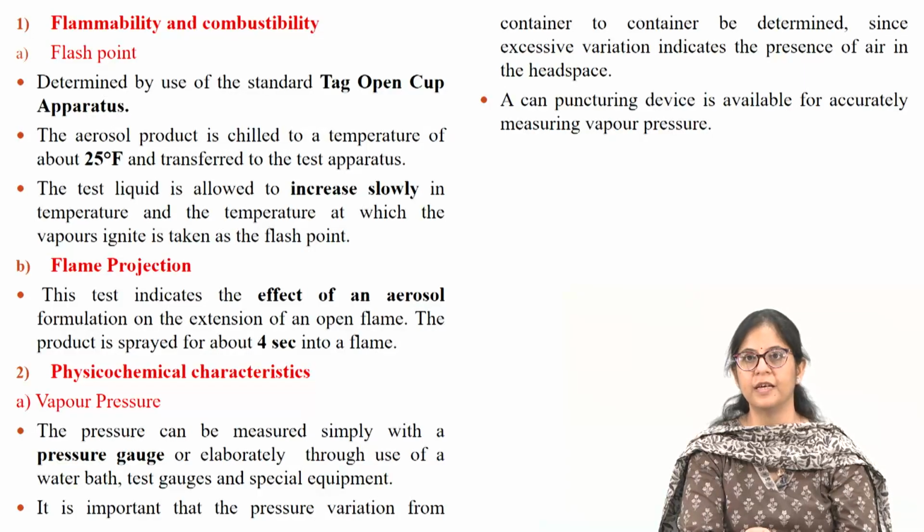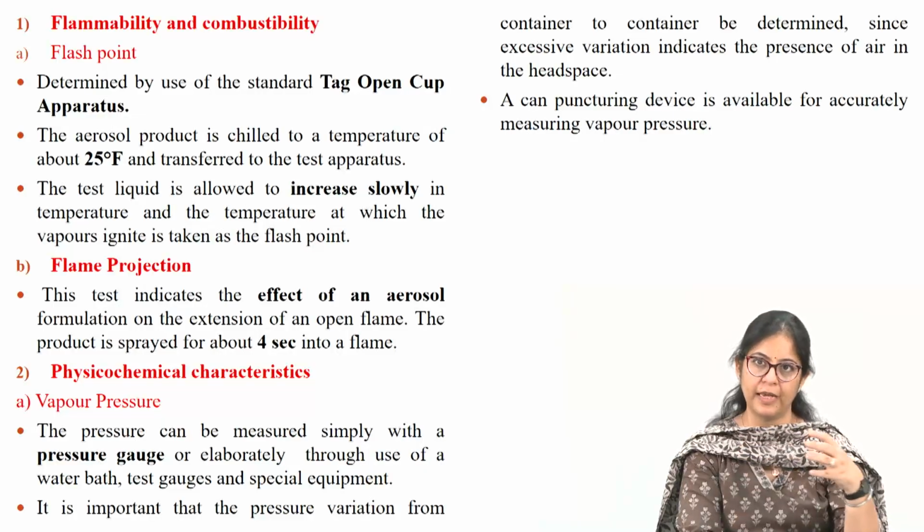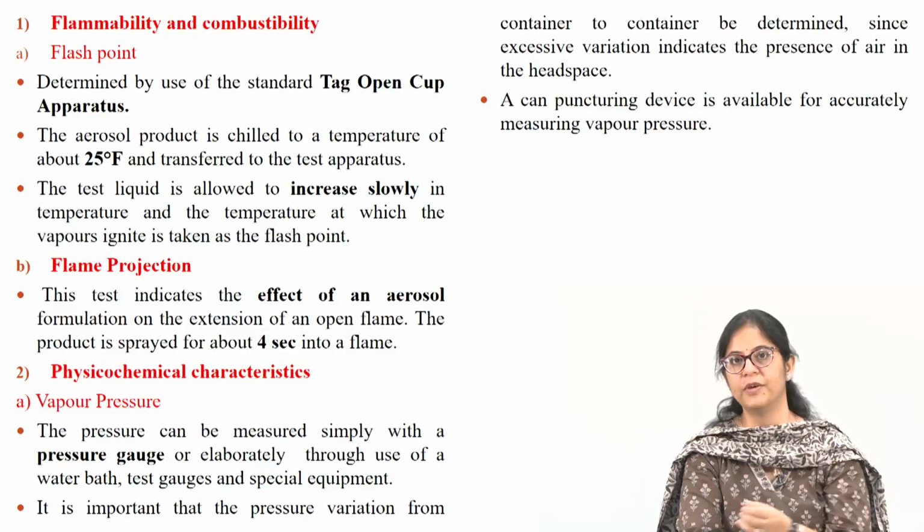Flame projection. This test indicates the effect of an aerosol formulation on the extension of an open flame. The product is sprayed for about 4 seconds into a flame. So, when you spray the aerosol on the flame, the length to which the flame gets extended is measured.